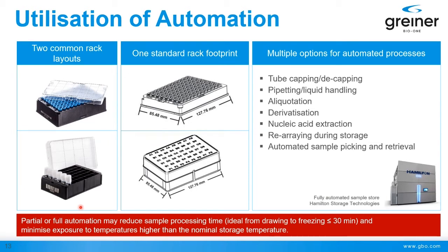But it's worth reflecting on the fact that a lot of effort is done today, and a lot of focus is put on the duration of processing of a sample in your workflow. So basically from the step of collecting a sample until the step of making sure the sample is safe, which often means it's frozen and stored in the cold. We know today that sometimes this can take really long because you get samples from the outside and there's shipment involved and all these kinds of things.